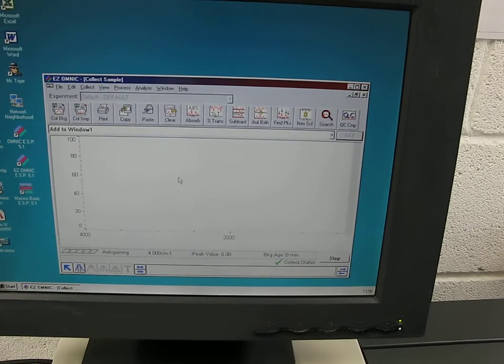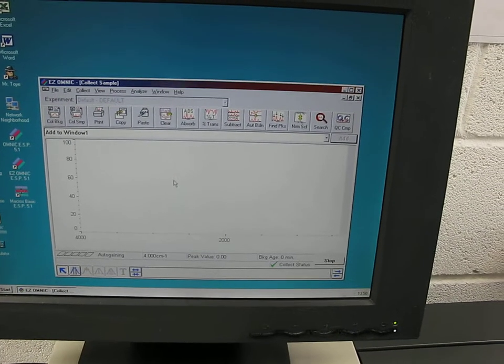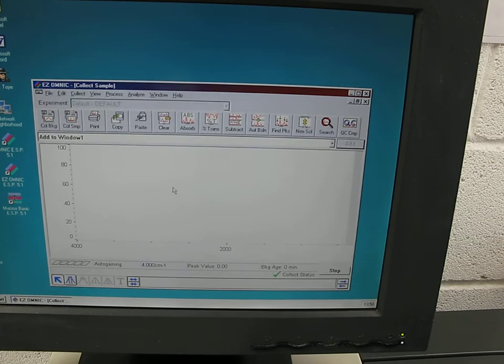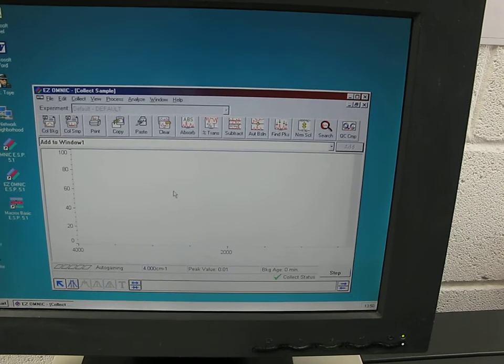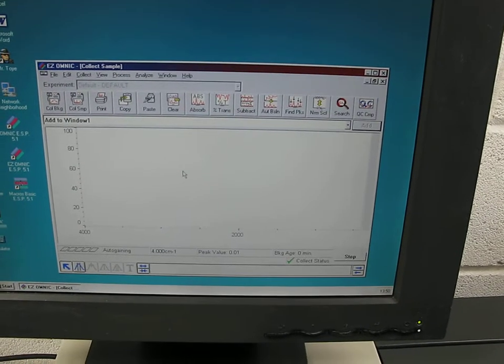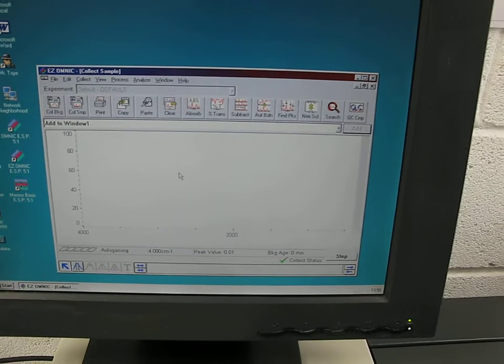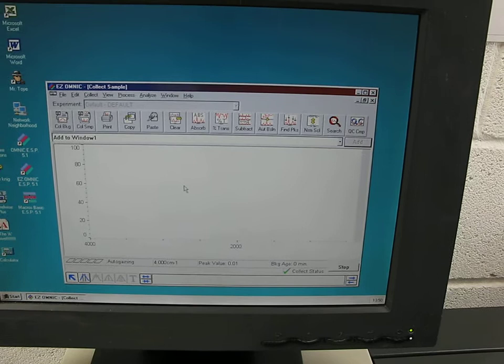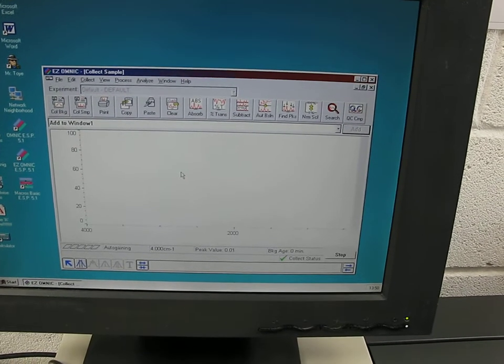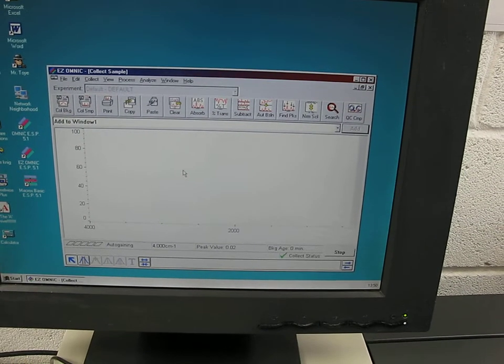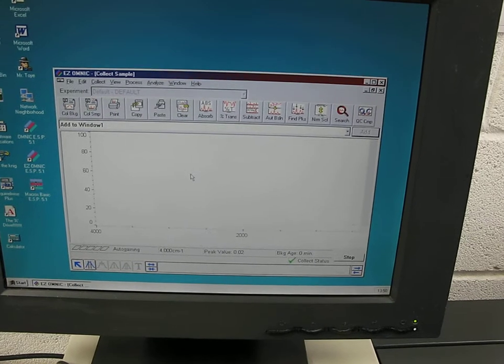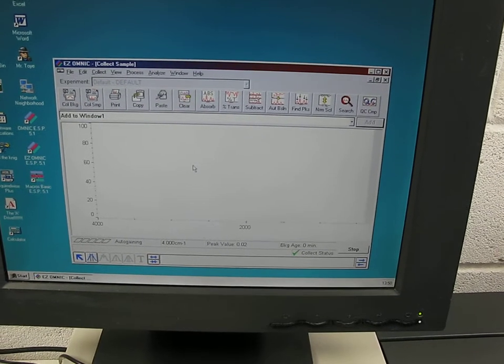So it's autogaining at the moment and then we should see the spectra come up any second. Of course, as always with these things, it's important that you get the background scan done first before you collect your sample.